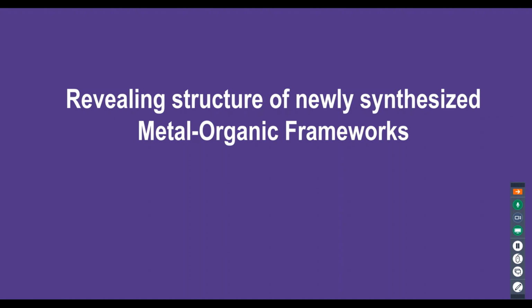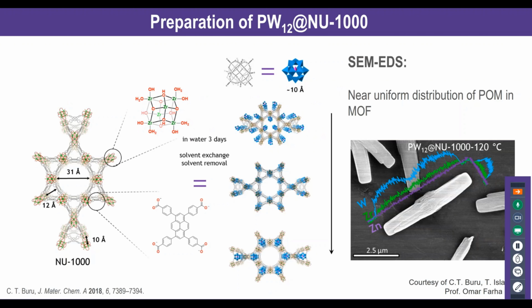So one example I want to show here is from the collaboration with Professor Omar Farha here at Northwestern. What they do is synthesize a variety of MOF structures. One that is particularly interesting here is the NU-1000. NU is short for Northwestern University, so it was synthesized in Professor Omar Farha's group.